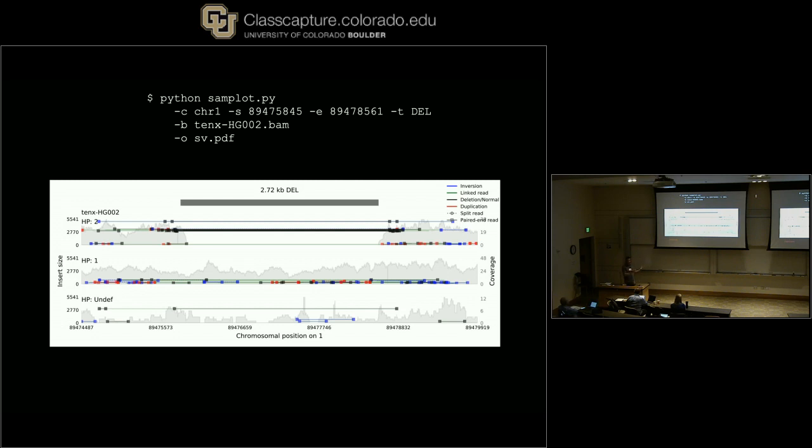And so now, again, you can see this is the same variant in the same position. You can see exactly who contributed this variant, which haplotype had the variant, and which haplotype did not. The extra information here is this thin green line that connects all of the fragments that were in the same original long molecule. It's called a GEM for 10x, so they take one long molecule, and all of the contributing pairs from that molecule are connected by this green line. So you can trace the actual event or non-event across the region.